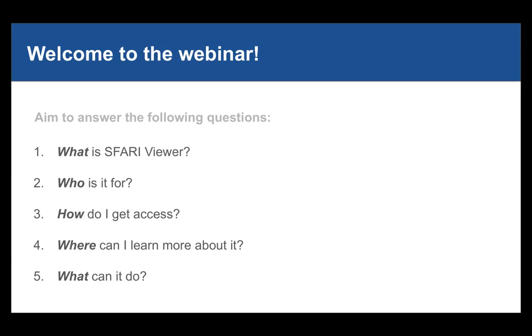We're going to mention some of the resources that are available that will help people learn a little bit more about what the tool can do and how they can provide feedback, comments, and maybe engage with both the team here at Frameshift and at SFARI on how they can use this tool themselves.